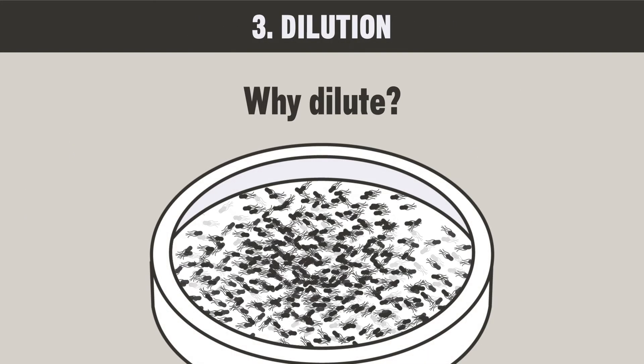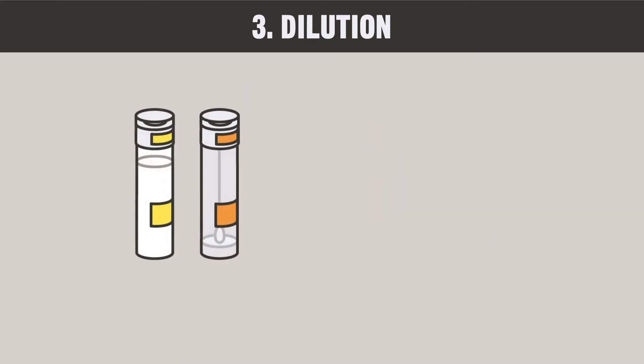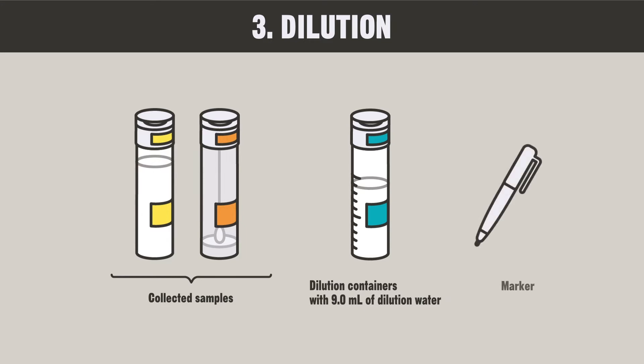If too many bacteria will overlap, they cannot be counted correctly. So, dilute the sample first. For dilution, use the collected sample, the dilution container with 9 milliliters of dilution water, and a marker.